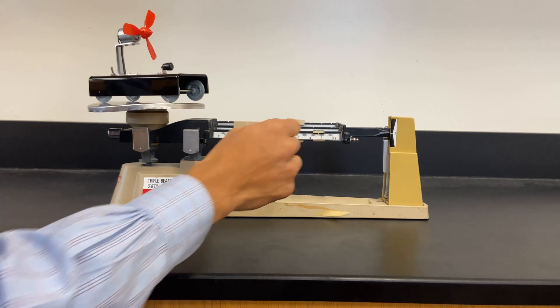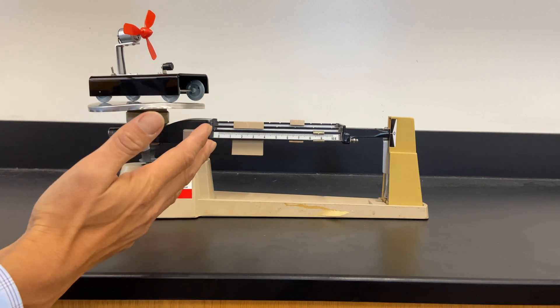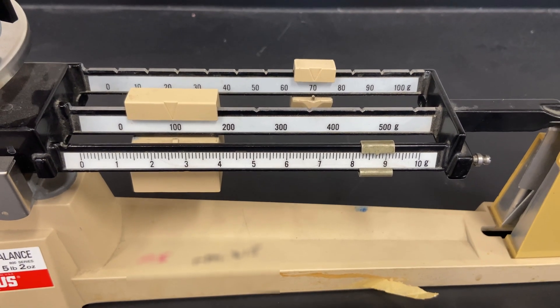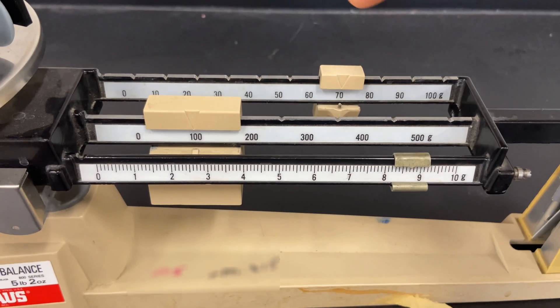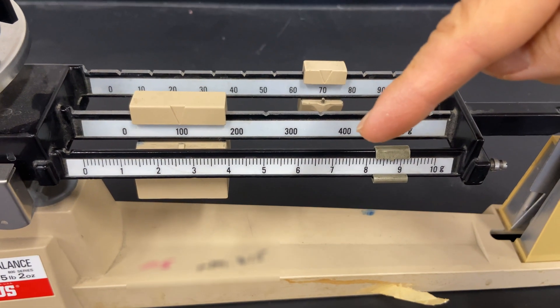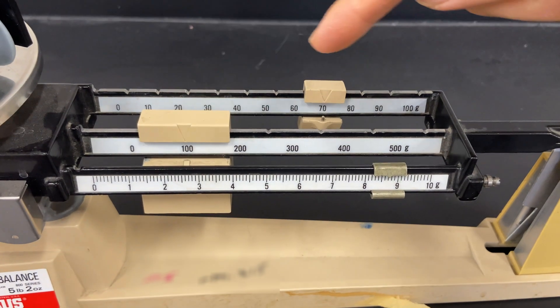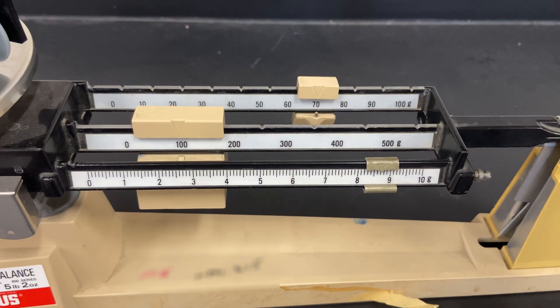We want to get that close to zero — right there. So what is the mass of this fan cart? The mass is 178.1, 0.2, 0.3, 0.4, 0.5, 0.6, 0.7. So the mass is 178.7.